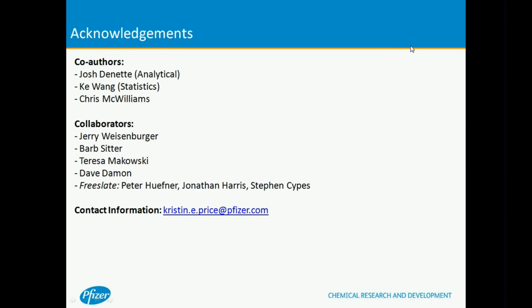Perfect. Thank you, Kristin. Another question that has come in is, if you see a second point that is a hit in the feedback loop after changing conditions, how do you determine whether it was the time, temperature, or reagent that drove the reaction to completion?